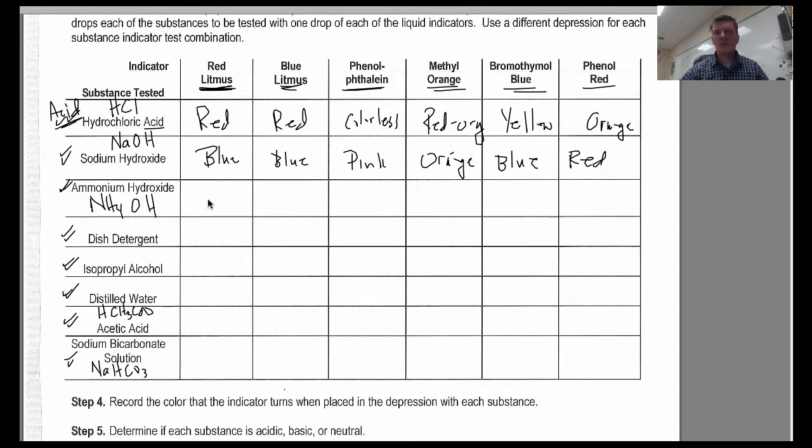Here, the ammonium hydroxide, sorry, we did sodium hydroxide. The ammonium hydroxide is blue, blue, and pink. This is yellow. This was blue. And we had red.